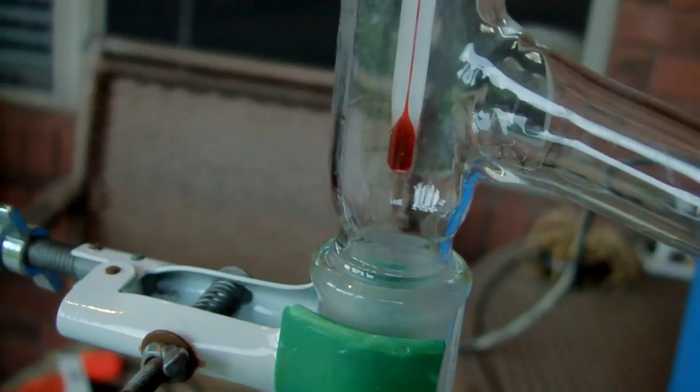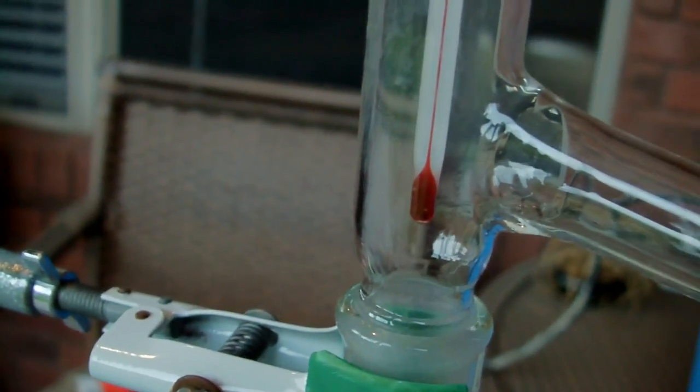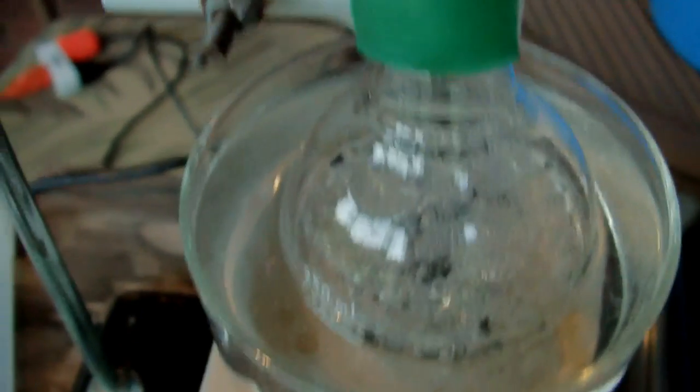So like I said, it's condensing on the bulb of the thermometer and that's going to lower the temperature a little bit and throw off the reading slightly. But I think I'm pretty confident that what I'm actually getting is dichloromethane. So we'll continue on.